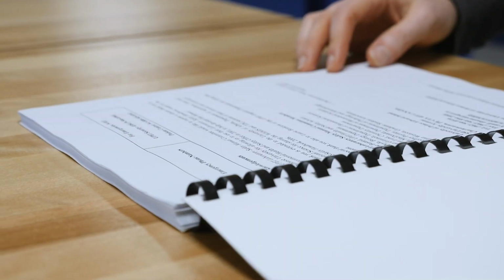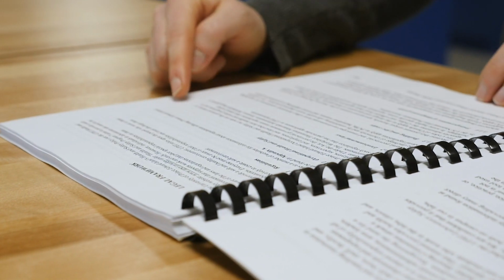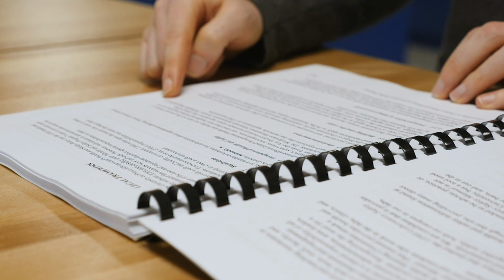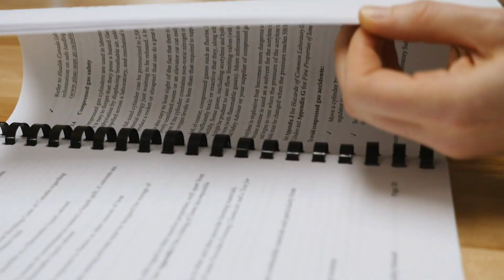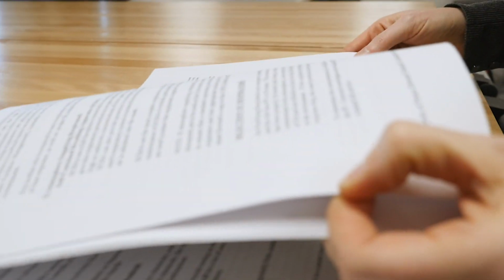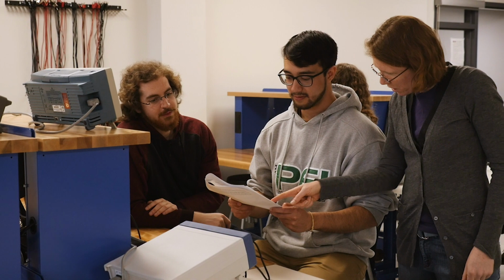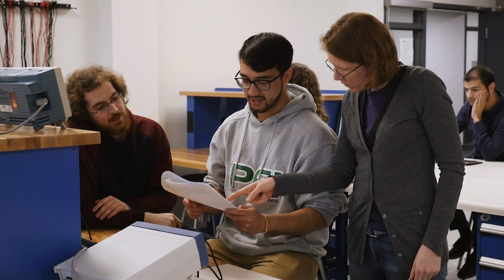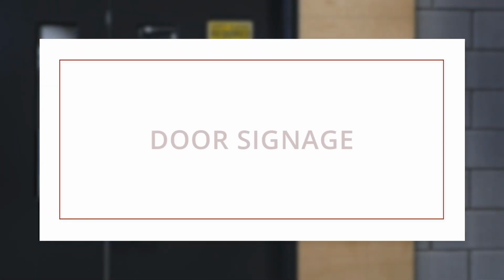All of the university's guidelines for safe laboratory practices have been compiled into one manual, the UPEI Laboratory Safety Manual. The manual is quite extensive, so as a student, you are not expected to read it in its entirety. Instead, this safety course, as well as your instructors and supervisors, will provide you with the appropriate information to complete your activities safely. If you have any questions or concerns, please ask your instructor, a technician, or the engineering area safety leader.